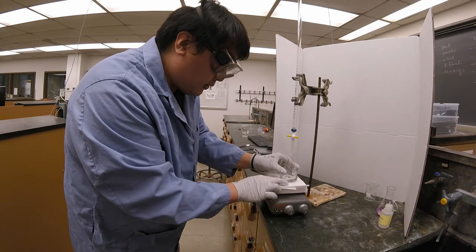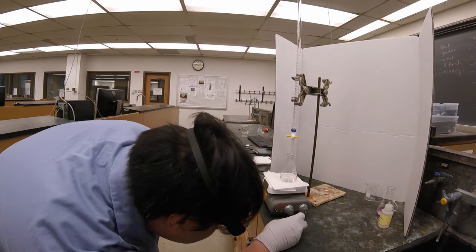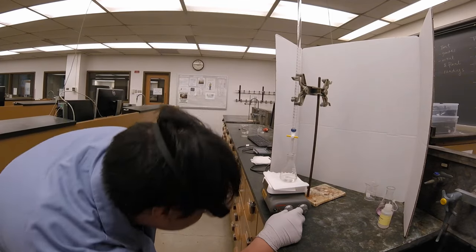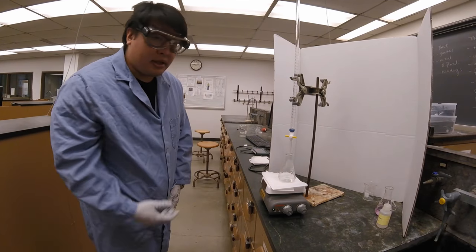Once the Erlenmeyer flask is on the stir plate, you want to turn the setting on to stir, and then we're going to do the titration.